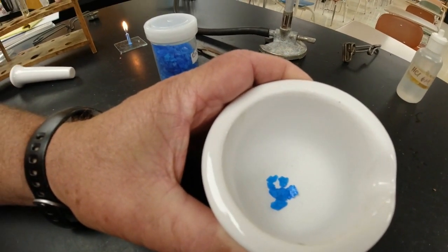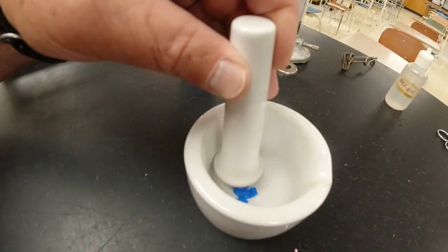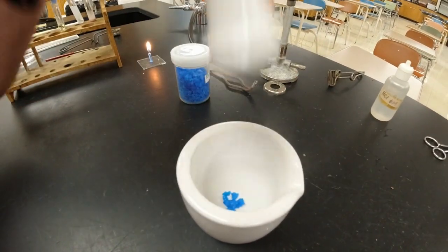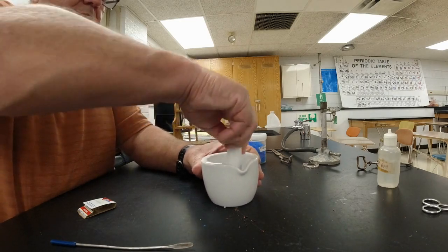Let's do what we do with the mortar and pestle. Now, the way to do this properly is you make a circular motion around it like this, and you grind them up like that. You don't hammer them because you're going to break things with that. So while I do that, let's grind that up.